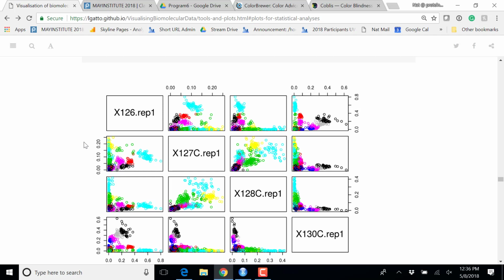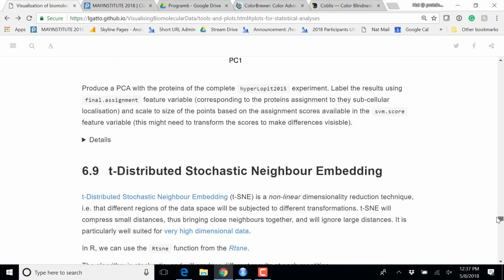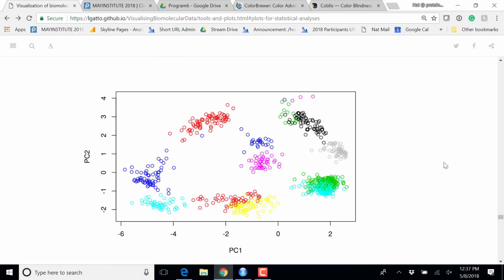So what you could do now is run a k-means clustering on this data set to identify the clusters, do a principal component analysis on this data set to extract PC1 and PC2, and then use the results of the k-means clustering to annotate the PCA plot. And that is typically how you want to visualize any results, is using principal components. I think that's an interesting exercise.